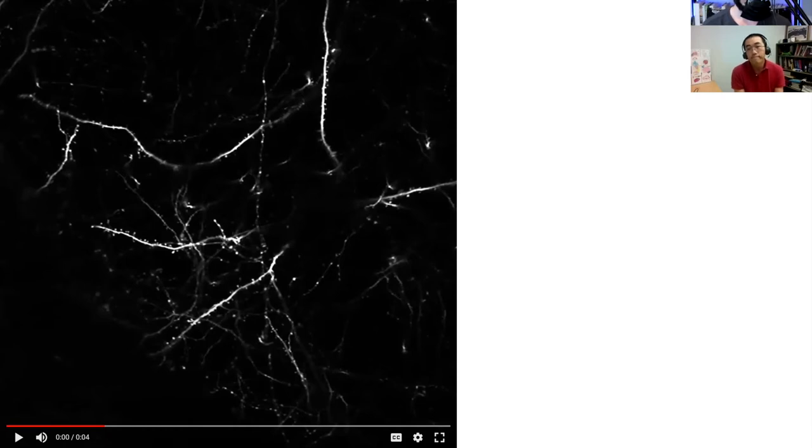So how do you guys look at dendrites and spines and use that as a way to quantify plasticity? Yeah, because these dendritic spines signify the possible sites of the connection, we in the lab would measure the density of these dendritic spines. So how many of them are present for each of the dendritic branches we see, which would then indicate the number of connections. The other thing that we would measure from these dendritic spines is the size of them, which would be the diameter of these little knobs. Because it's also been shown and it's quite well known that the size of these dendritic spines relates to the strength of that connection. So if you have a larger head, that typically signifies a stronger connection between these pairs of neurons, and if you have a smaller spine, then it's a less mature connection, probably a weaker connection.